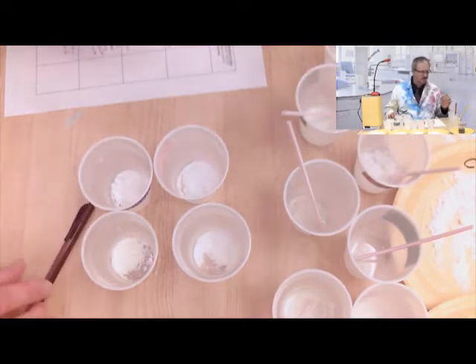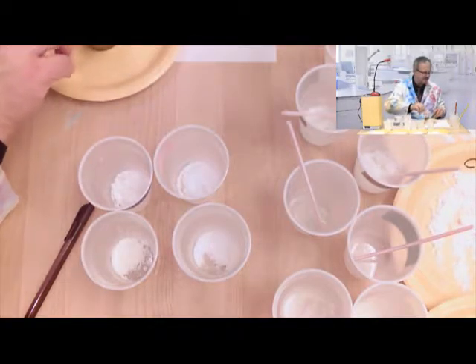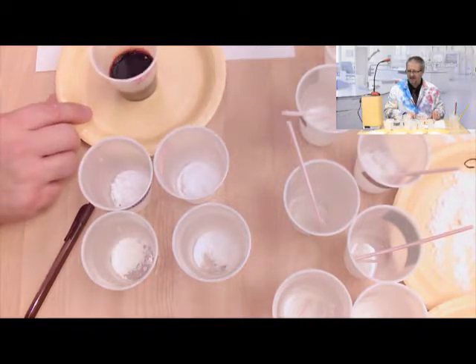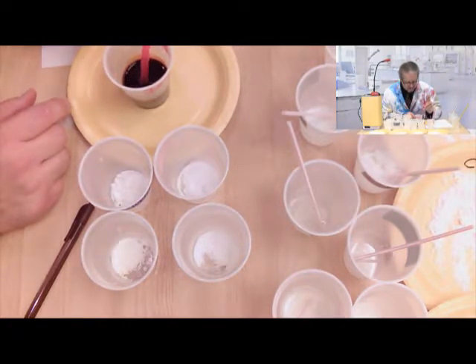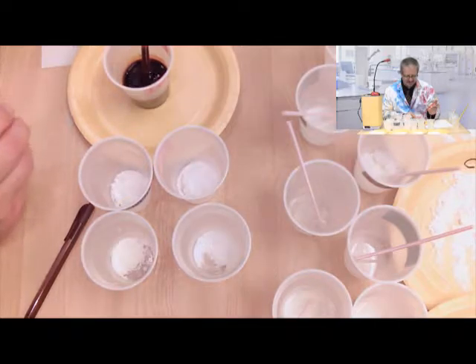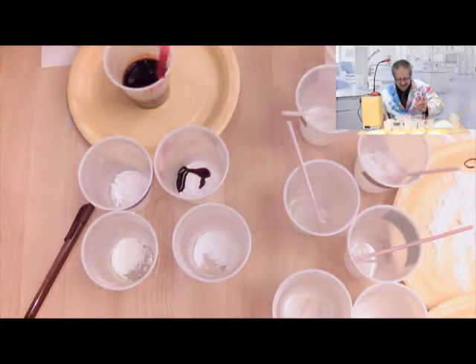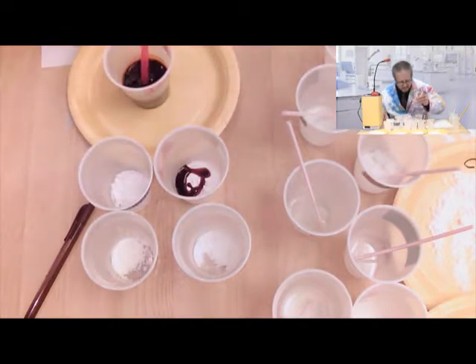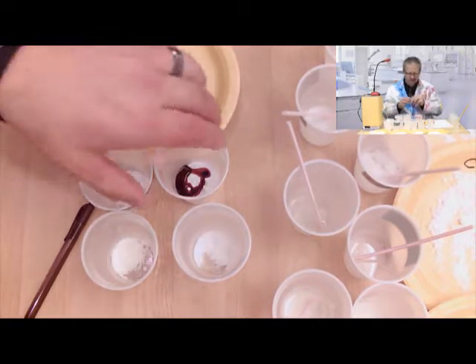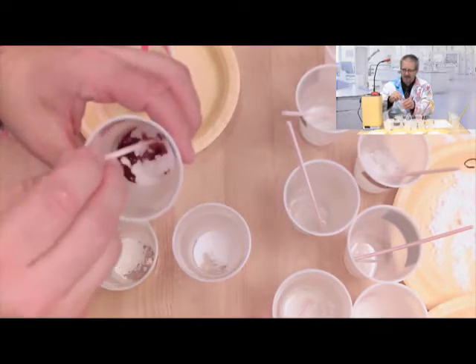Okay, so where's my iodine? Now iodine stains very quickly, very easily, so we're going to be really careful with it. And it looks almost black when it's all together, but when it's apart, it looks orange. So here's A. Stirrer. See if we can stir that up a little bit.